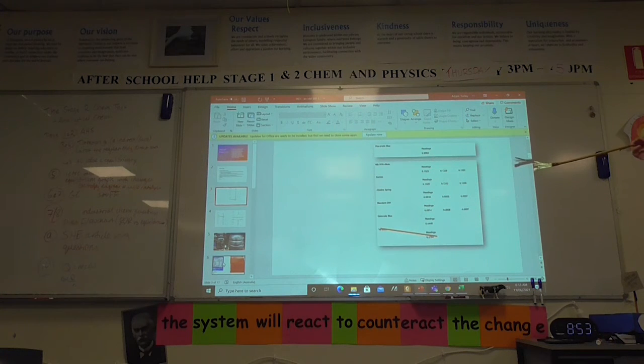Why do you think we run the standard solutions at different concentrations every 5 results? Check if it's... Yeah. Those absorbances should be the same. If they're not, it can give you pause to second guess the result you get. The other thing to note is it does 3 readings, and they're all different. You average them. It's almost like a titration with the concordant values. This is a very powerful mechanism to get the concentrations of metal ions within a solution at very low concentrations themselves.